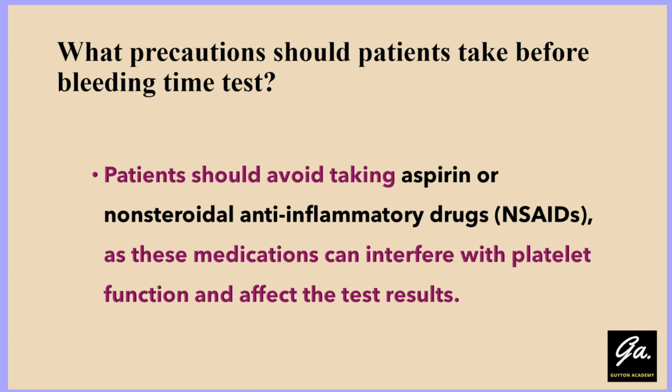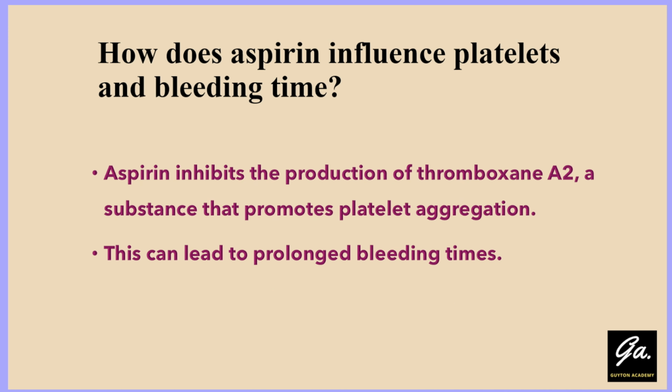What precautions should patients take before the bleeding time test? Patients should avoid taking aspirin or non-steroidal anti-inflammatory drugs, which we also call NSAIDs, as these medications can interfere with platelet function and affect the test results. So, patients should avoid use of these medicines the night before the test is performed.